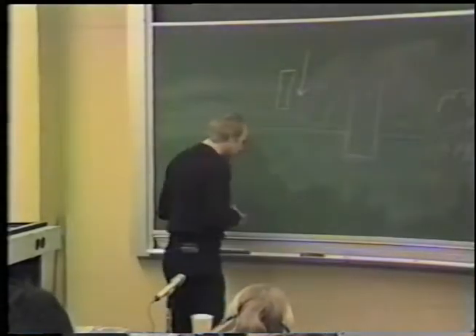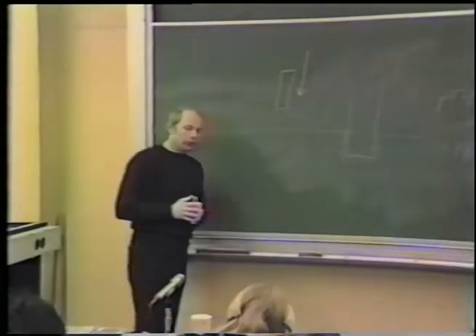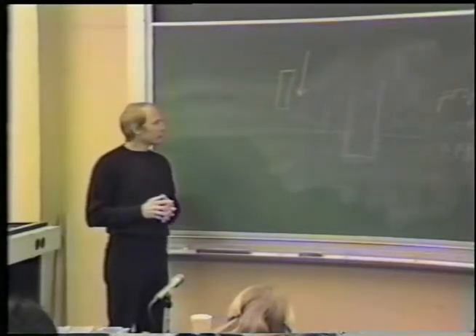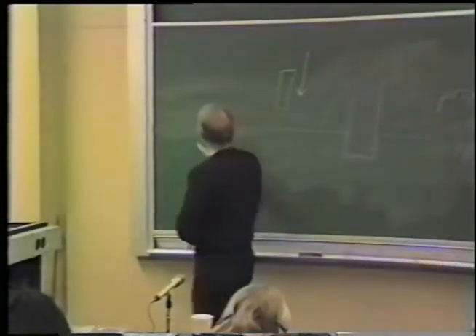You can get up to reasonable rates, not really high rates, but rates high enough that with a sample prepared appropriately with the proper geometry, you can get ultra-rapid freezing to a depth of a few microns. Say about 5 microns, if you're lucky.